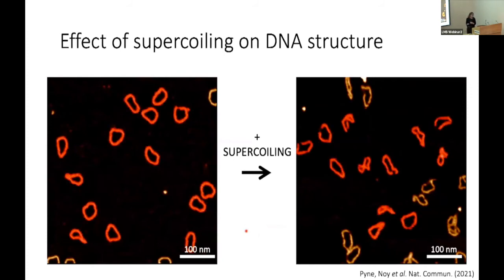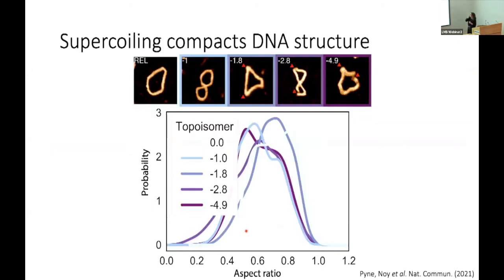What happens when we supercoil DNA? What do these defects mean for DNA structure? Well, this is where I have to apologize to my PhD student, Carveth, who's luckily graduated and gone to work at Google and no longer has to repeat all of these experiments, because when we first did that, I assumed we'd got these wrong.